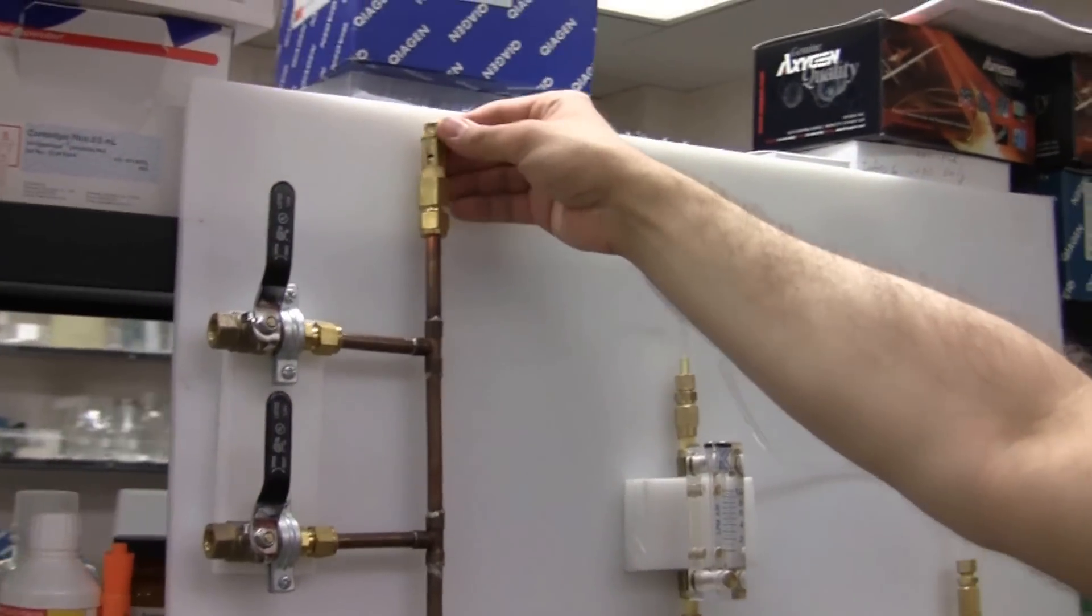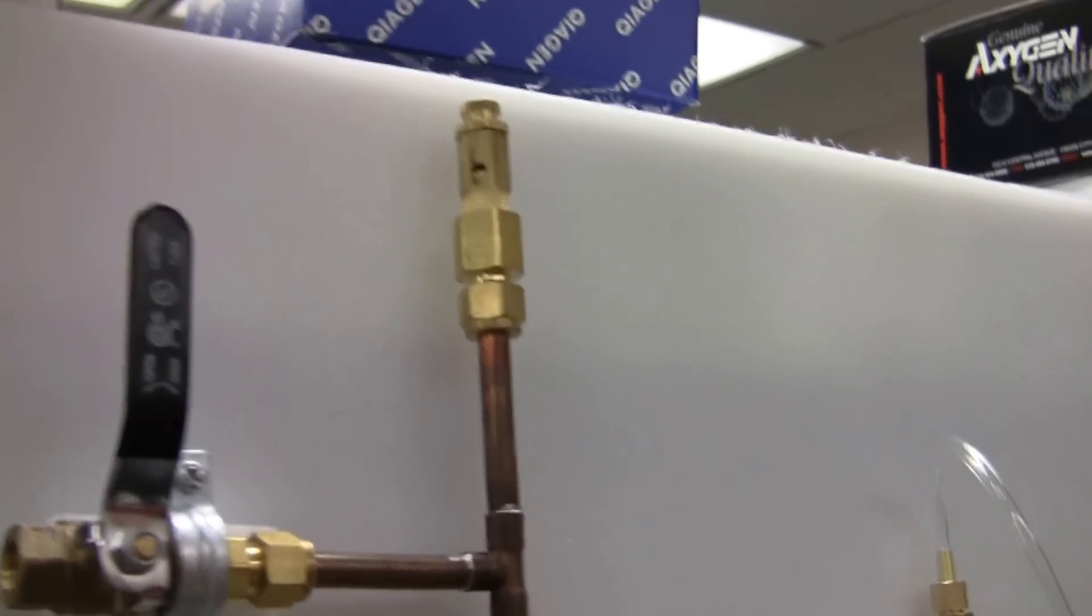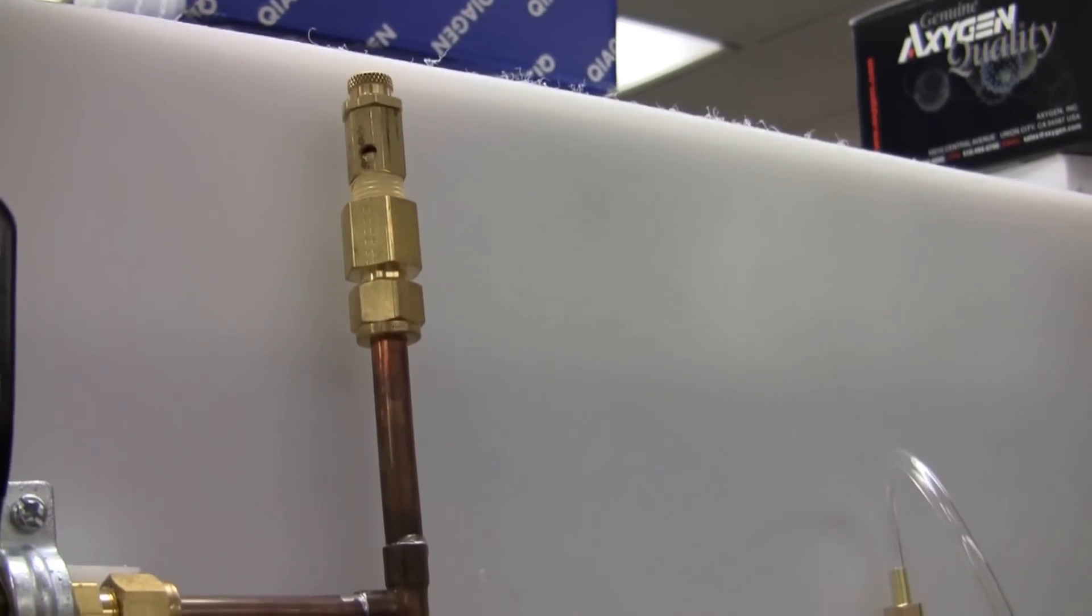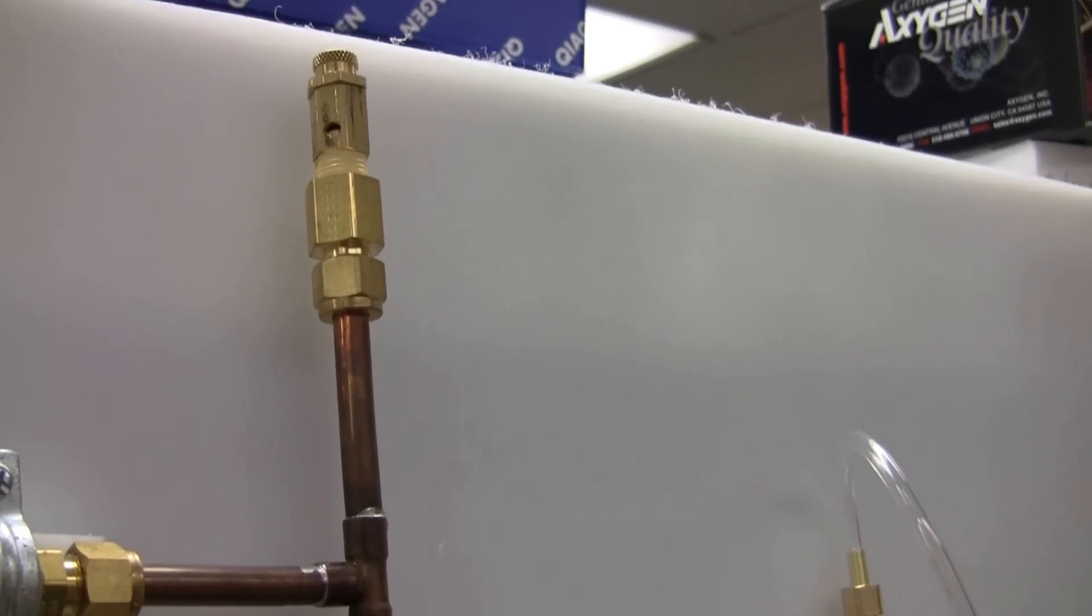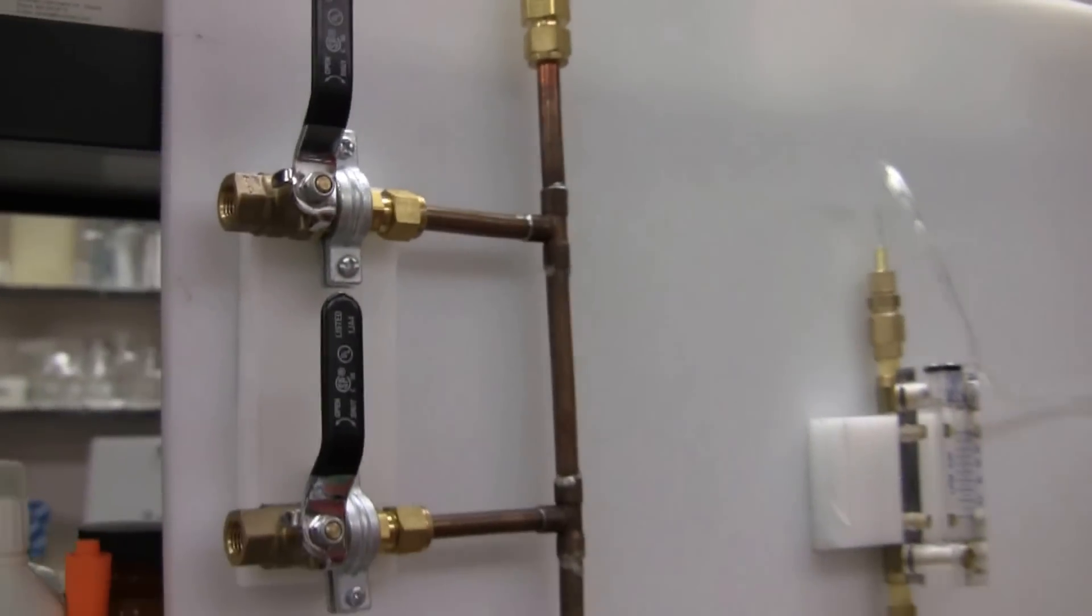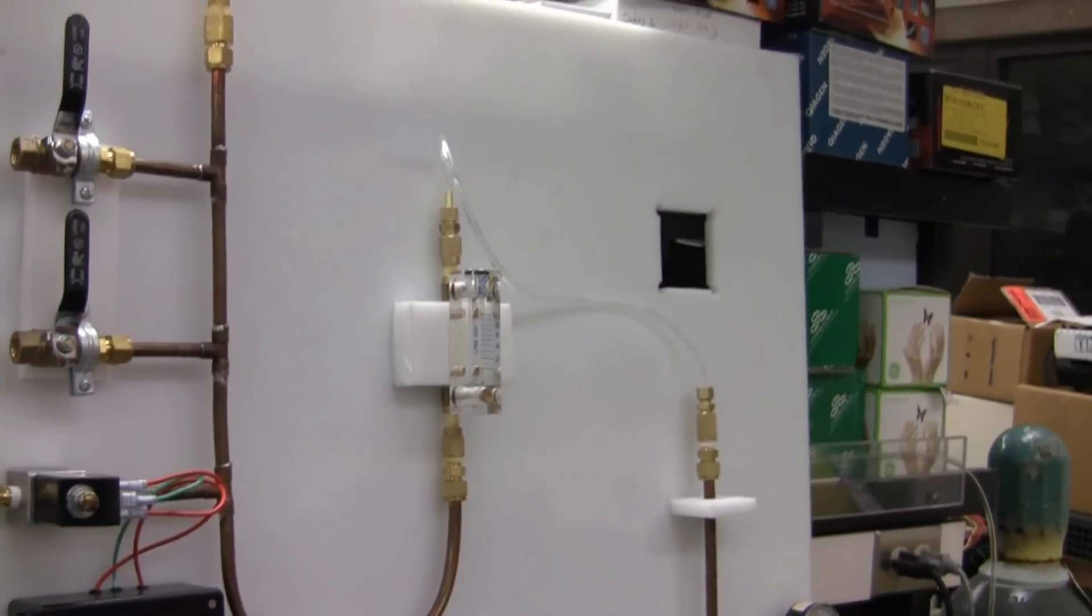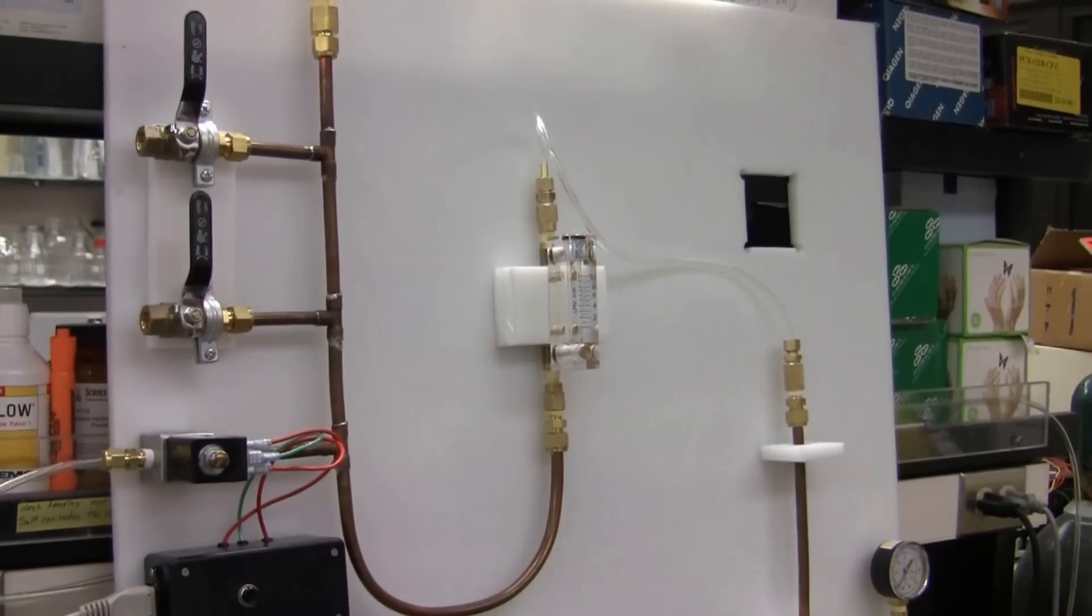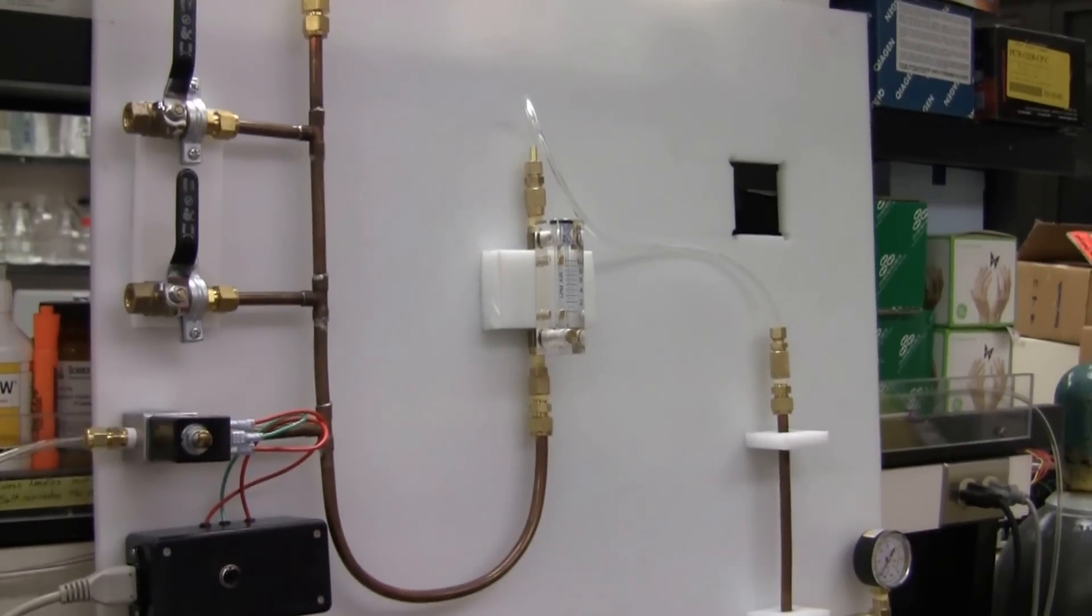Final, very important piece here is the overpressure valve that triggers at 70 psi, which is slightly higher than the suggested pressure of 60 psi, and will protect the rest of the system from destruction.